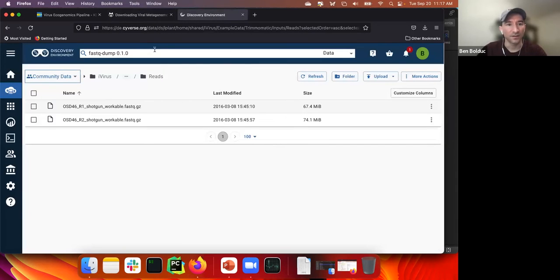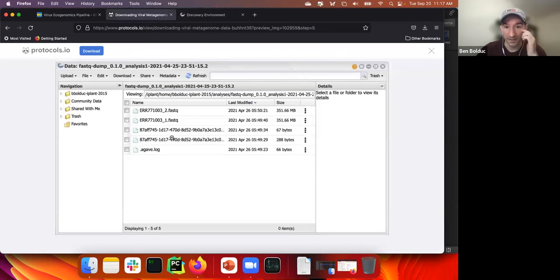And let's just assume that they're the ocean sampling day reads or whatever. You'll get them and you'll have two files that have the errors or the outputs or anything that was generated from the run. And let me actually open up the questions in case anyone's having any. Okay.